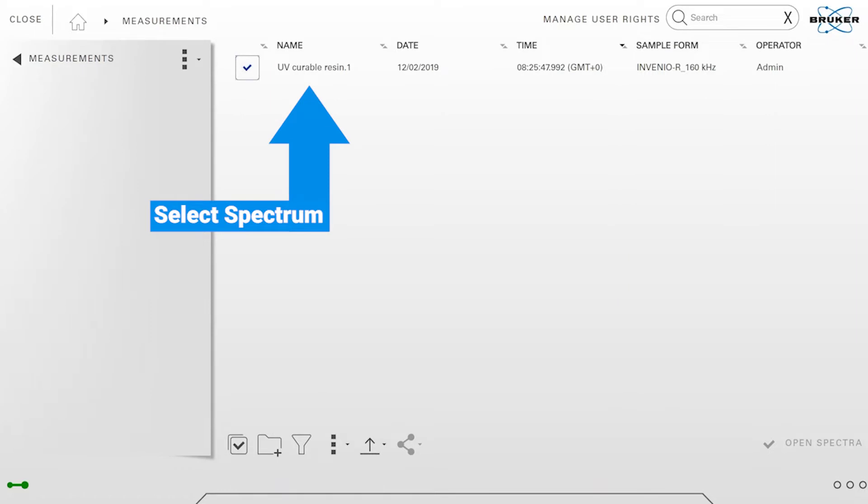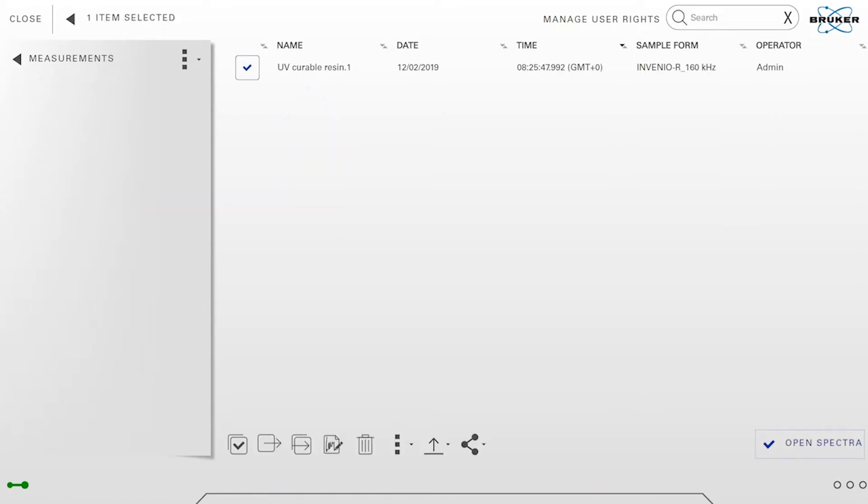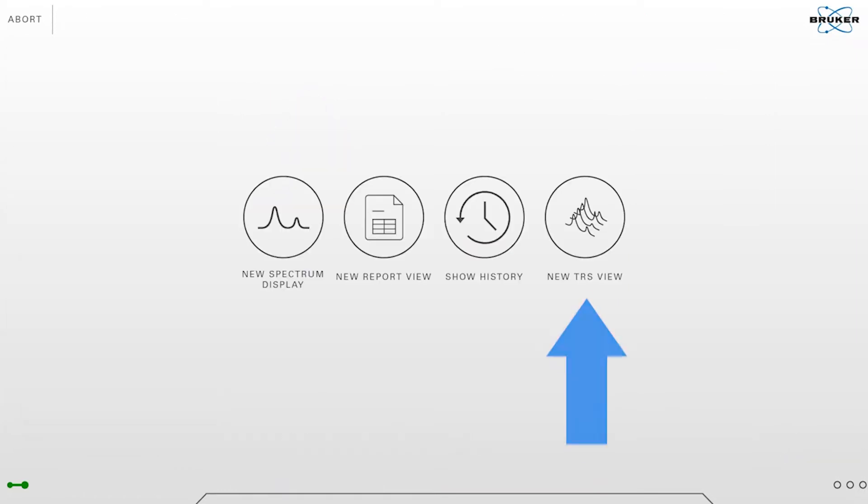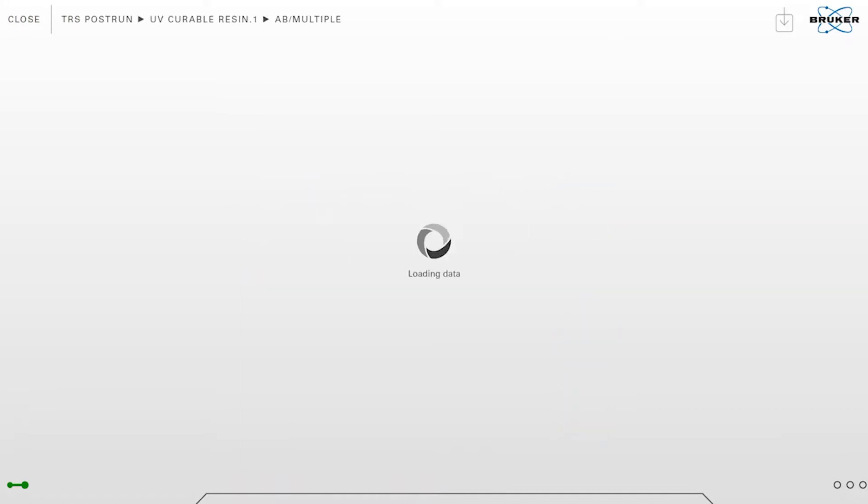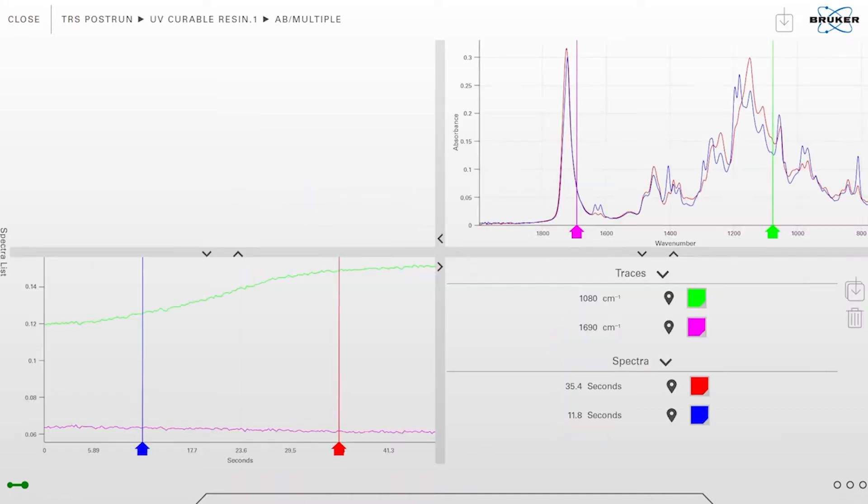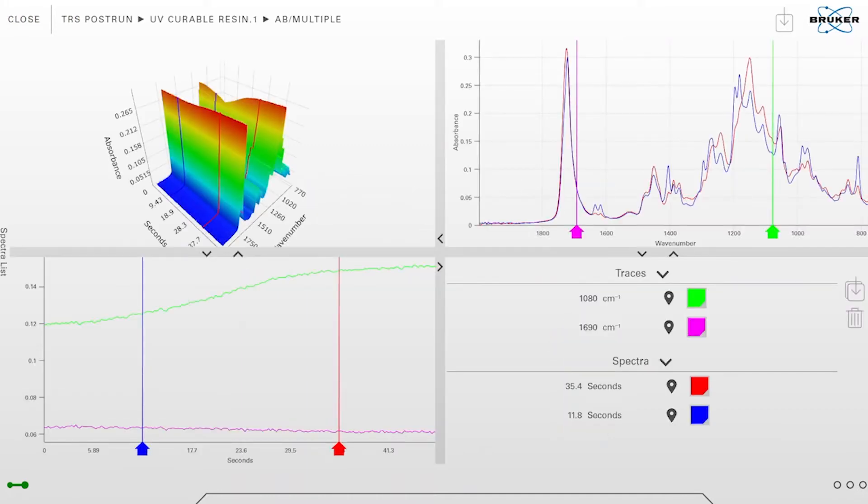It was a UV curable resin. I will open it and tap on new TRS view. Now the file is loaded and you can see this view is divided into four different tiles.